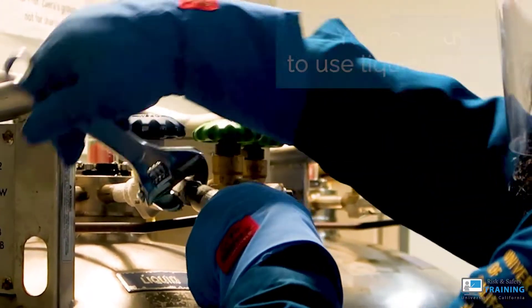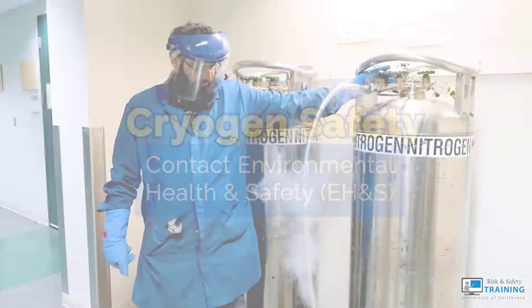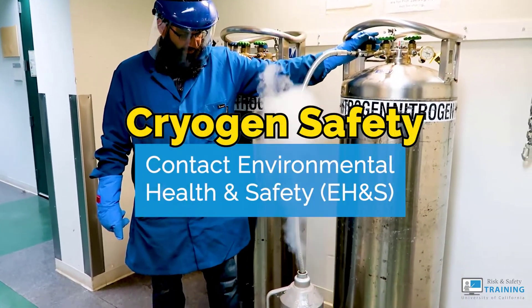Afterward, store the transfer line and tools and you're ready to use a liquid nitrogen material. For more information, contact Environmental Health and Safety.